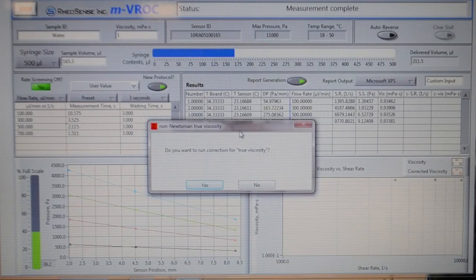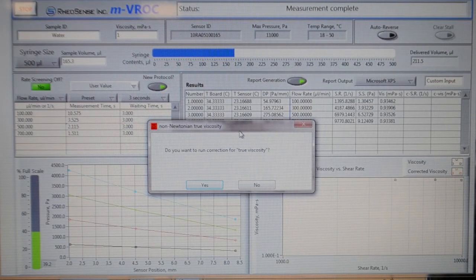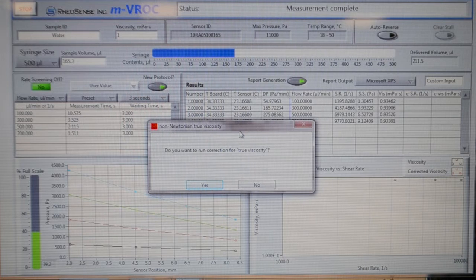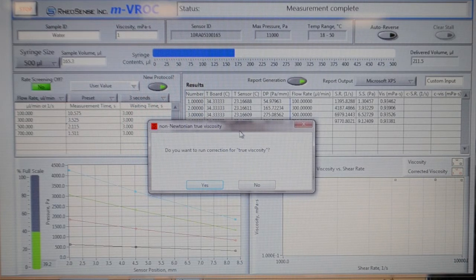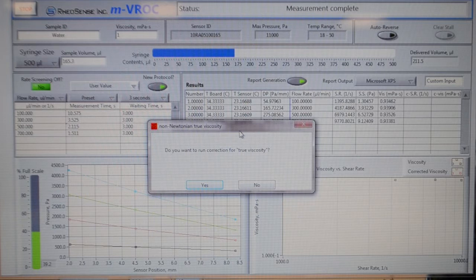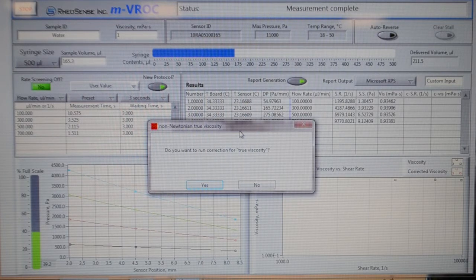When the prompt for true viscosity correction appears, click No if your sample is Newtonian, meaning the fluid's viscosity is constant at different shear rates.